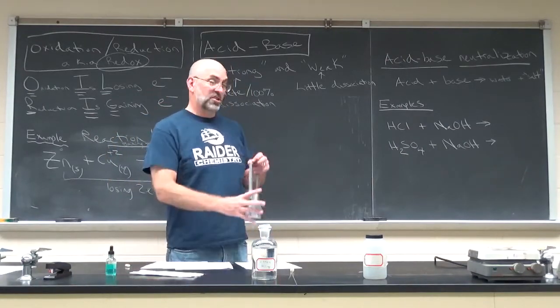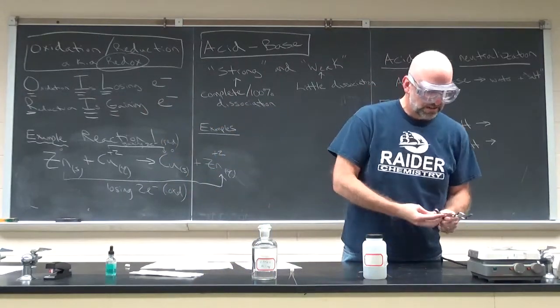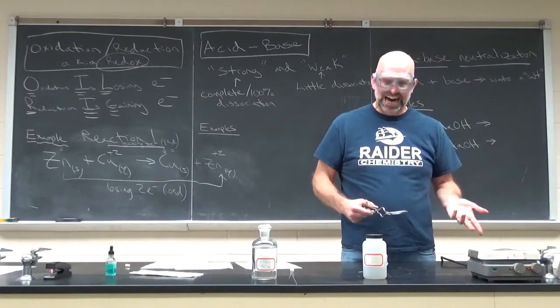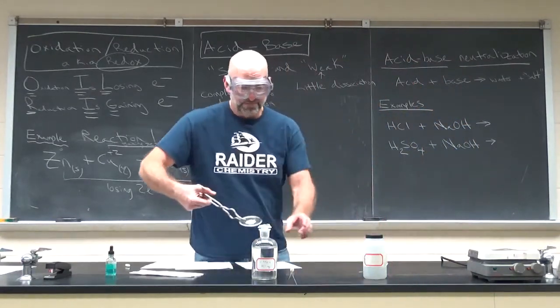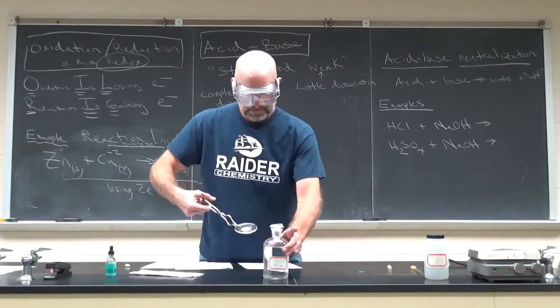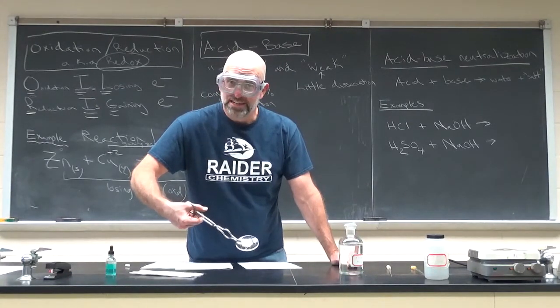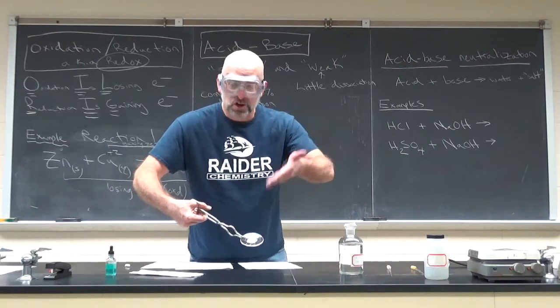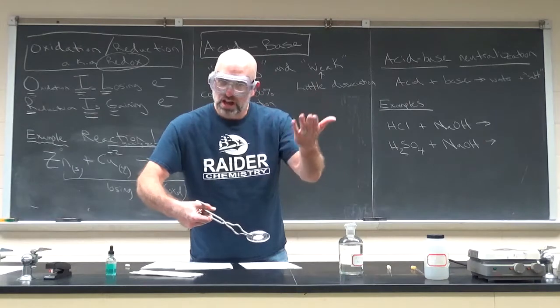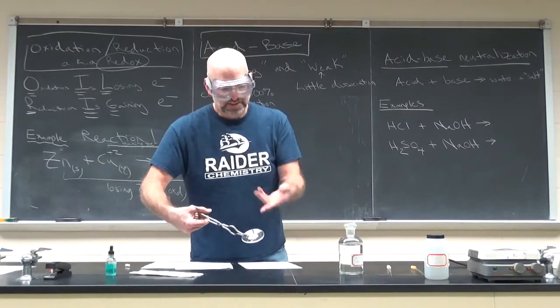So procedure 1, let's go back to what we did. It is done. This glass plate is still a little hot. Pretty sure you can see that. I'm thinking you can probably see what's on this plate right now. It looks a whole lot different than it did before, where it was 2 clear, colorless liquids put onto the plate. And then I boiled off the water rather than let it evaporate. What do you think that substance is right there?